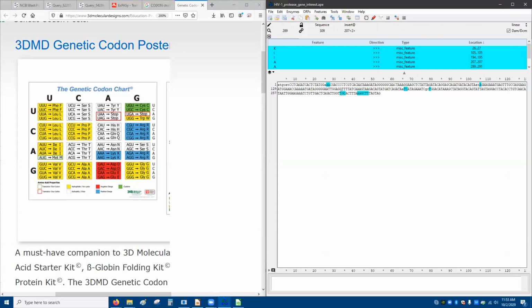Next, TGC here. We want A, alanine again. That could be GC anything, so we're just going to do GC. And then here we want, which is, where you at?